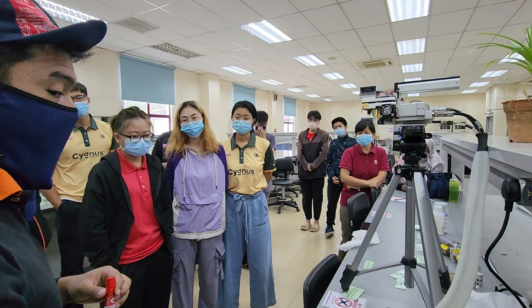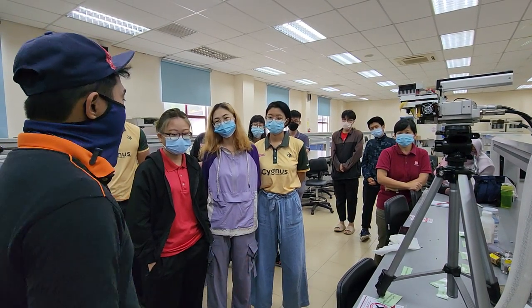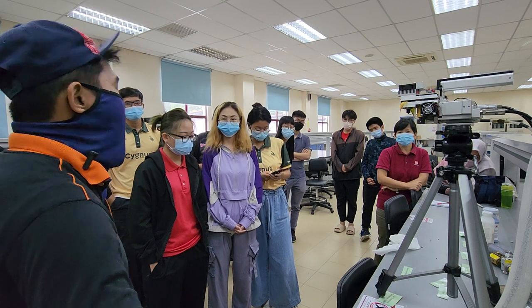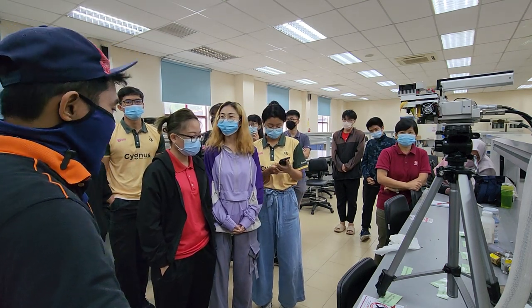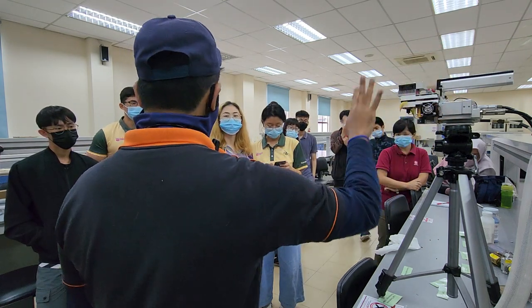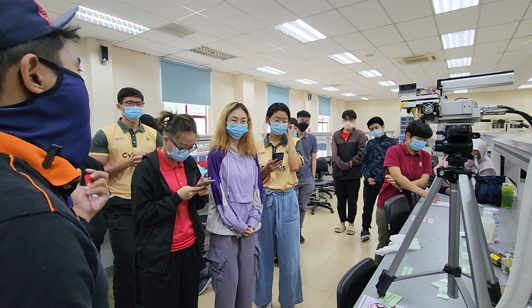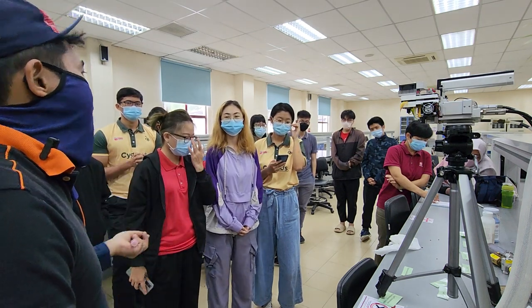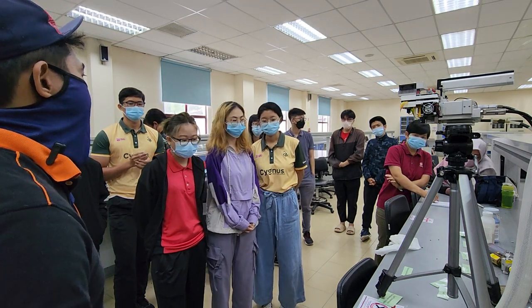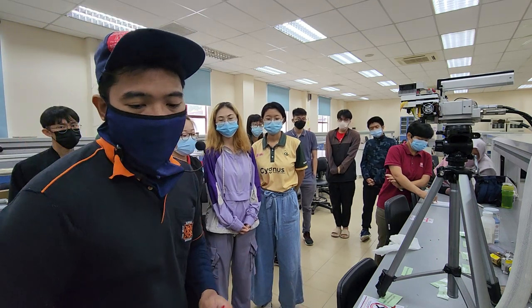The compute part, this machine is like your calculator. When you press log 12, it knows how to calculate, right? It doesn't have to go to the bookshop, buy the book, or do all the calculations with some poor abacus. The equation has been equipped in this. There are thousands of equations in here. The machine just receives input values from all the sensors, and then these values are plugged into all the equations. There are equations for photosynthesis, for stomatal conductance, leaf boundary layer, and also for relative humidity. There are also sensors for atmospheric pressure in here, so it will change according to your location. If you go to Cameron Highlands, the sensor is going to read differently. Okay?